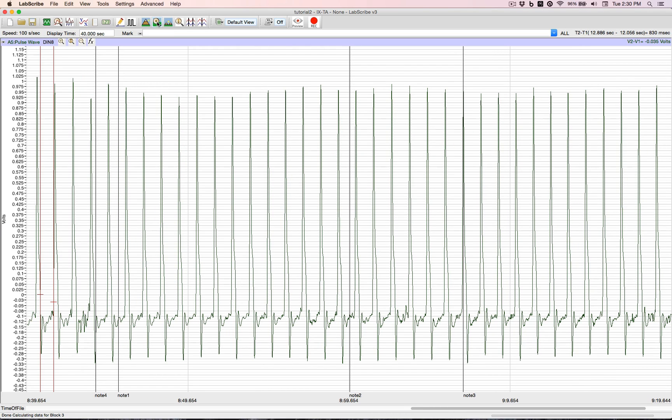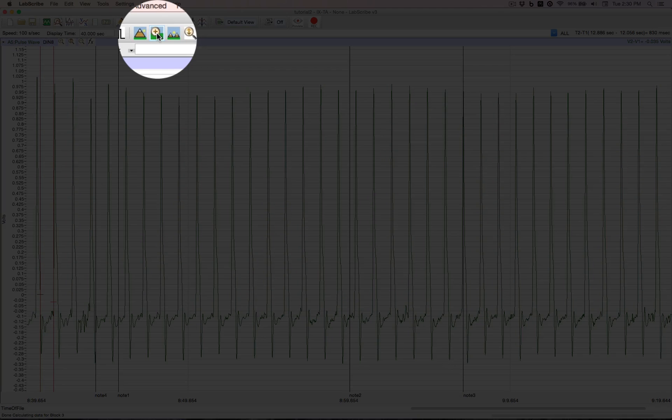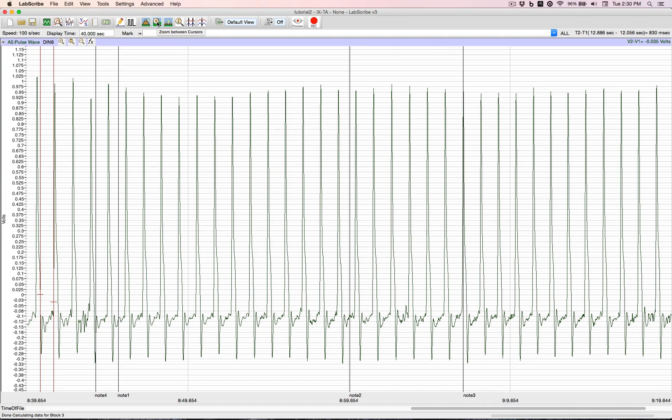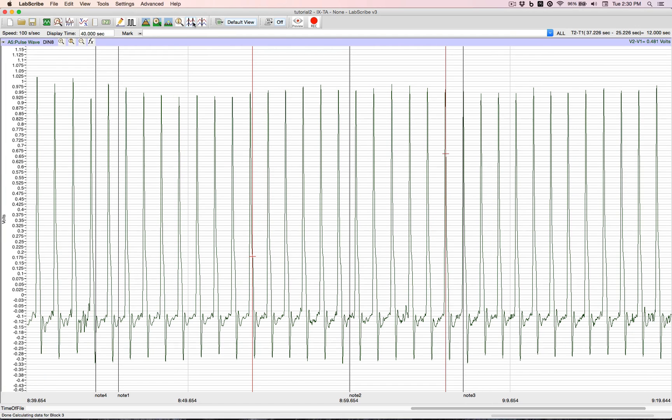Now zoom between cursors allows us to home in on an area of interest. We need to bring up the double cursors. We need to position them around an area of interest.